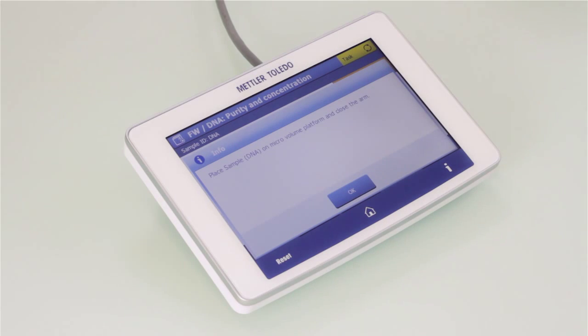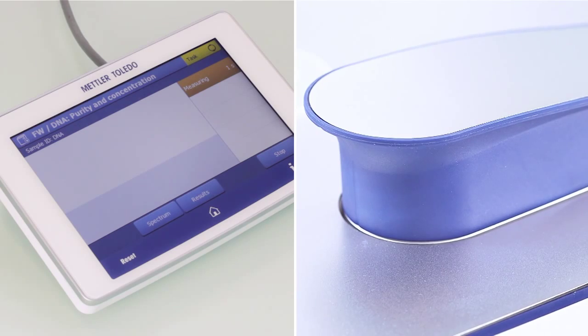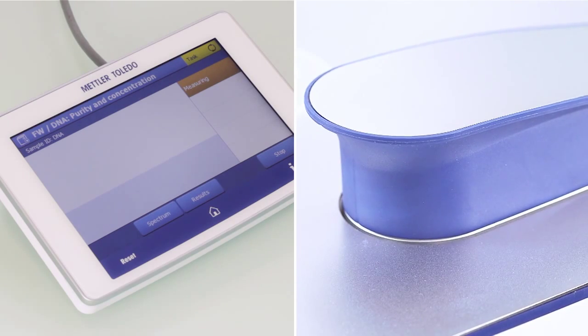The instrument prompts the user to add the sample as well. Once the prompt on the touch screen has been confirmed, the arm is locked to the 1 millimeter pathlink and the measurement is started.